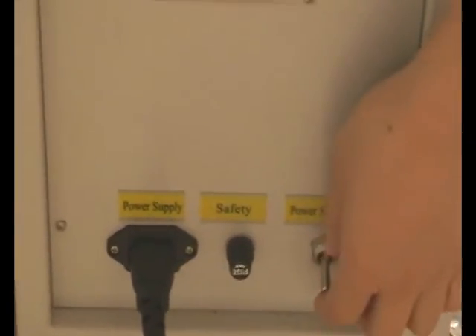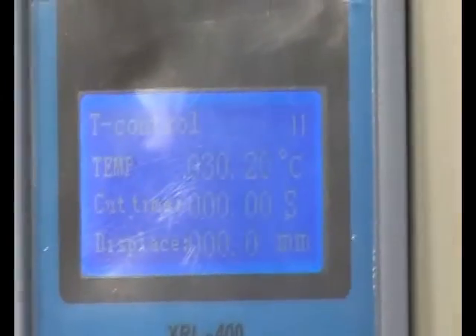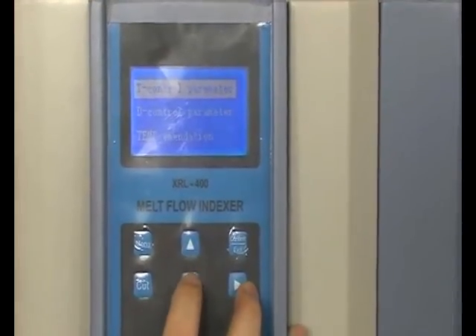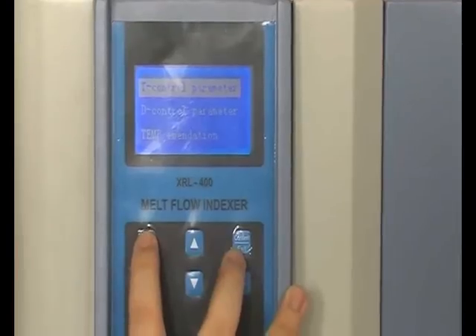Turn on the power, then go to the welcome interface. Press menu to enter the test type interface. Press up and down to select the test type. Now we select temperature control, then press menu to confirm it.